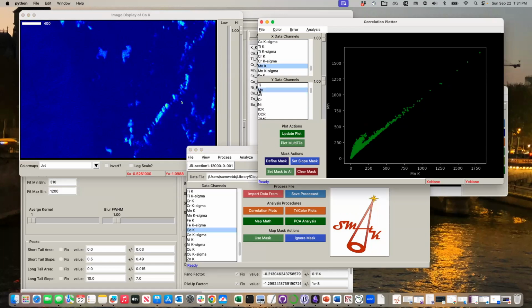And you can see, oh, wow, look. So there was one area. In general, it looks pretty good. But there's one area here where we had much higher manganese in the bins than the fits would produce, right? And now if you remember, we can say, well, what area was my problem area? What area was I about to misinterpret? Draw that little box here in our zoom.